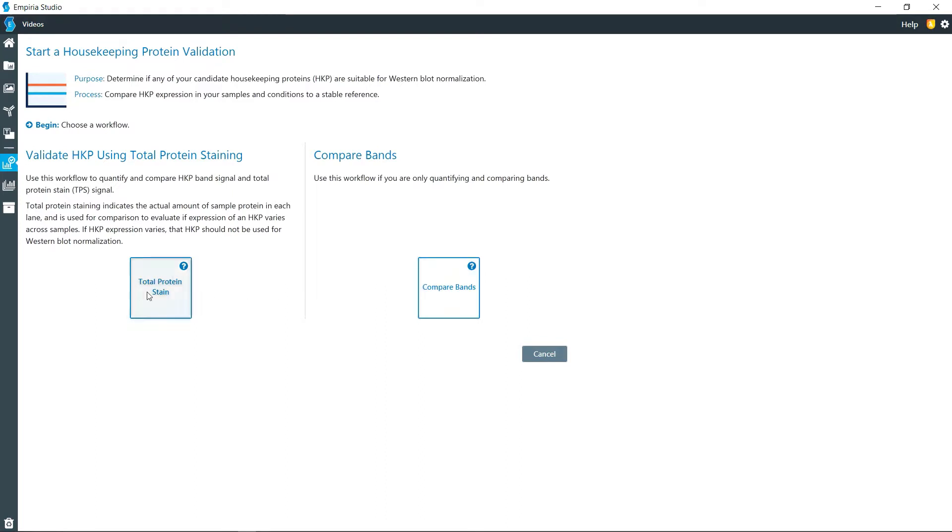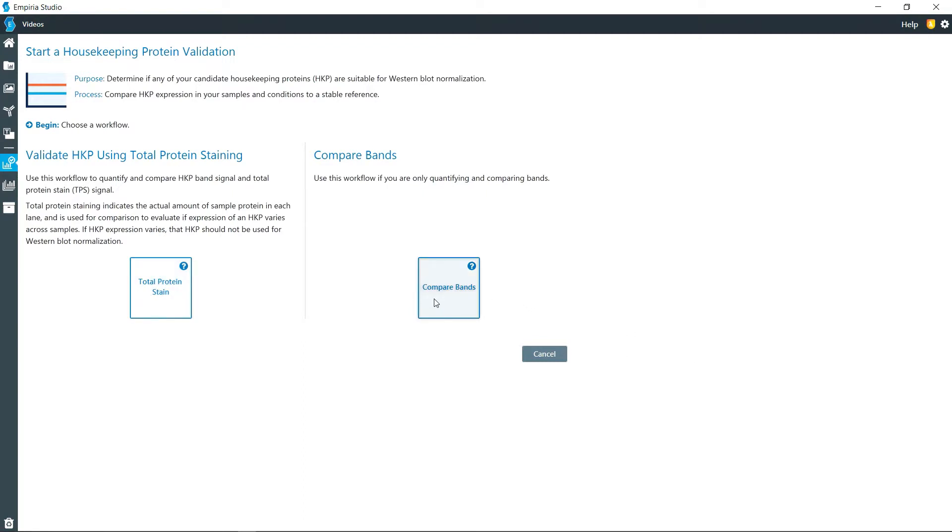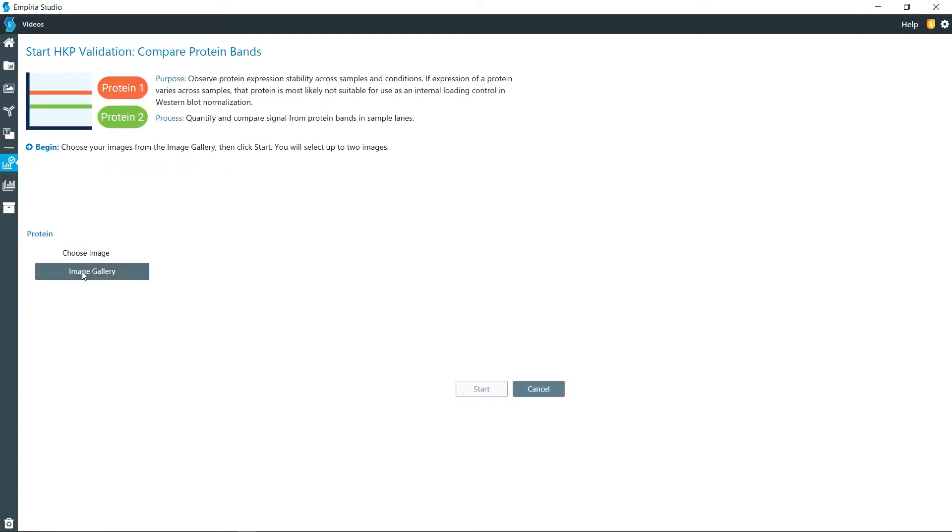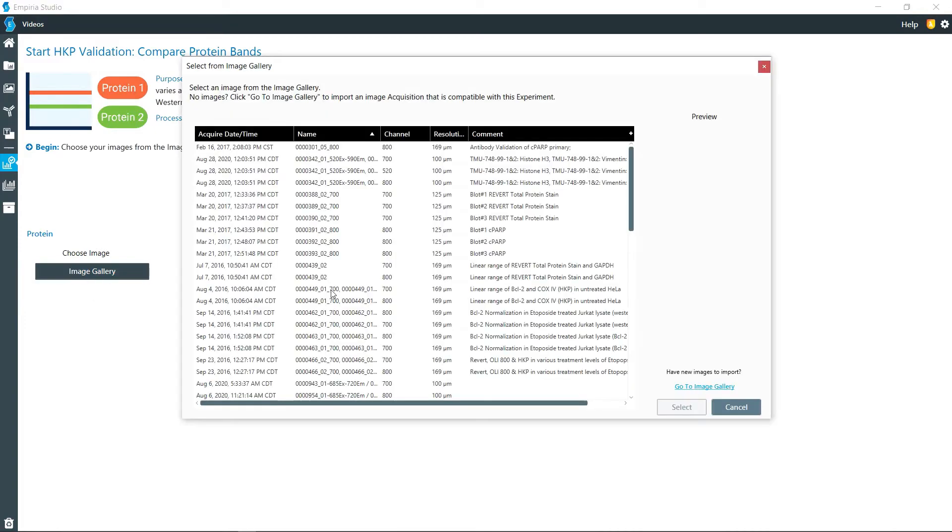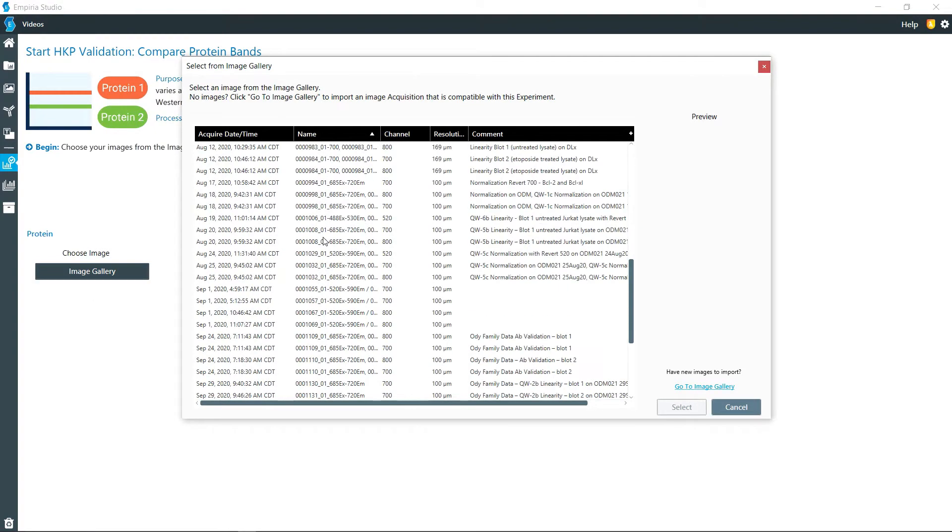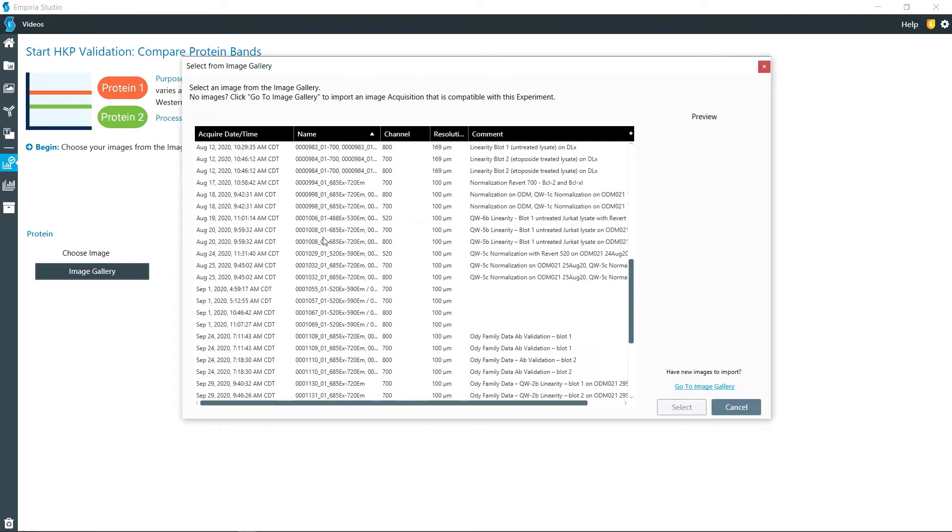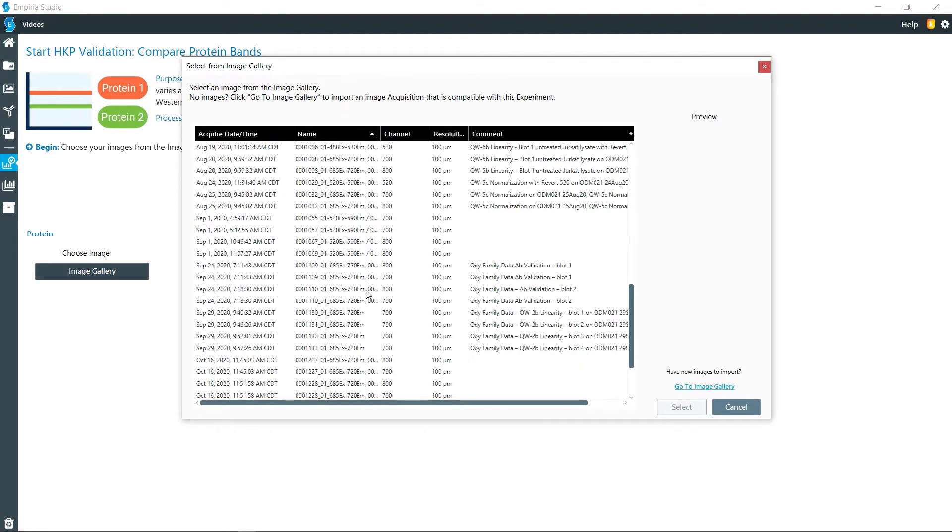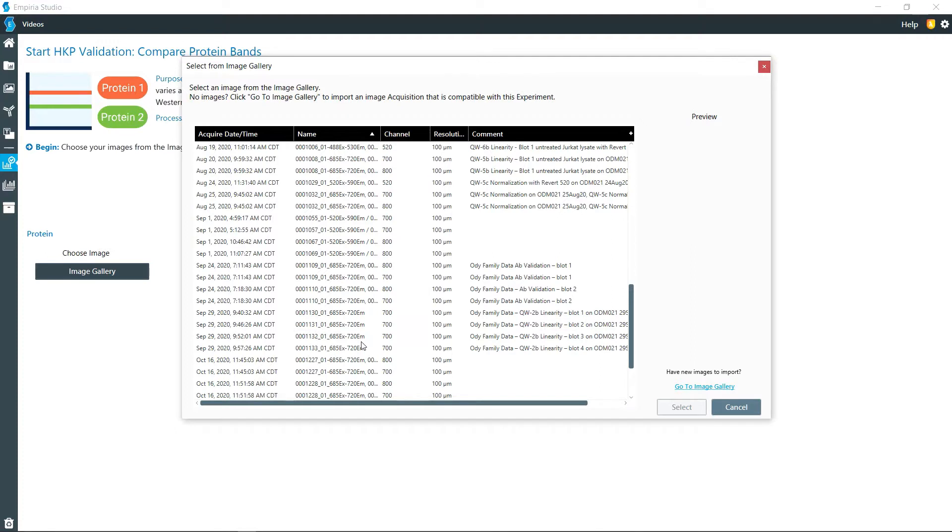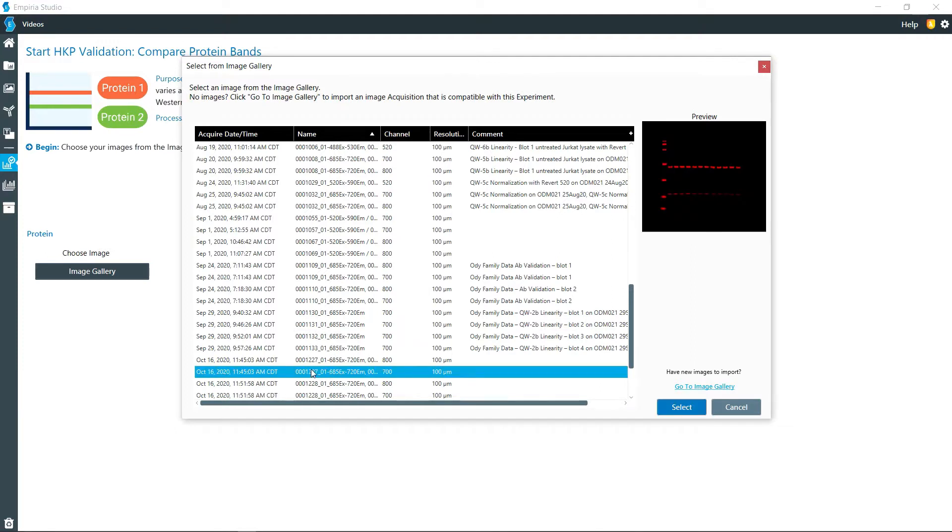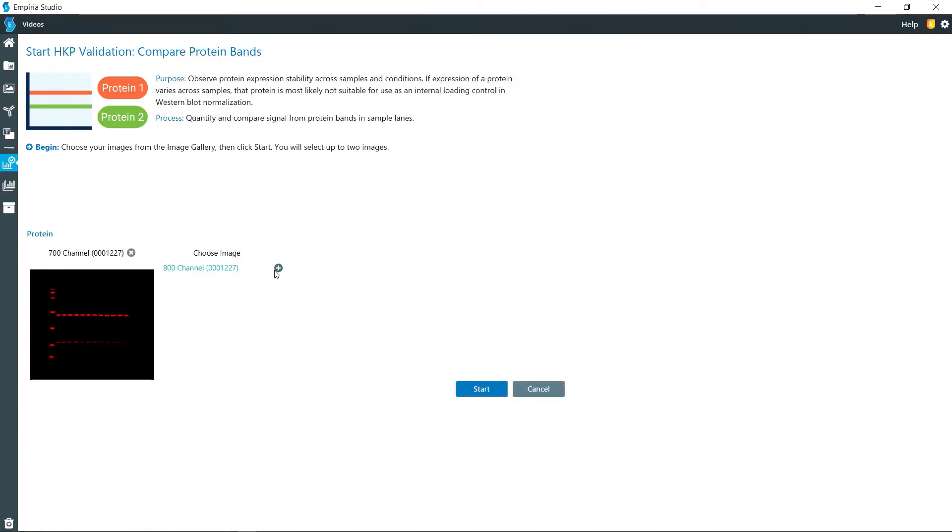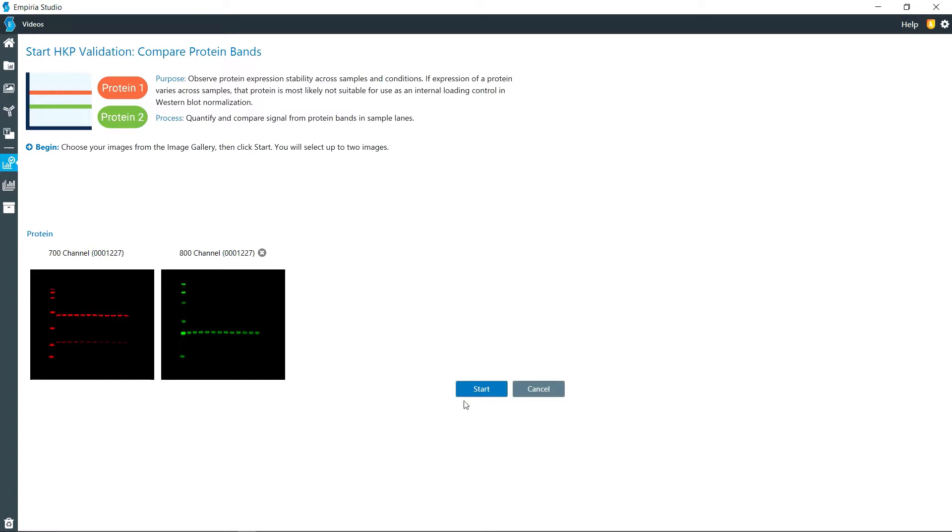The only difference if you have the total protein stain is that you would import that other scan and use that for comparison. So I'm going to open up my image gallery right here and go down to the image that I need. I need both colors from this particular image, so I'll select that one and then I'm also going to add the companion image from that same scan.